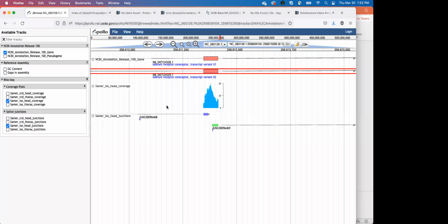Okay, so Fringy's question is also a question about how you annotate, which is covered in the other webinars. But for this group, I would recommend doing multiple sequence alignment. So get all of the proteins that you want for your particular question, and the fly ortholog, maybe one from Apis mellifera or Tribolium, based on what you were describing earlier, and put them into Clustal or whatever your favorite multiple sequence aligner is.